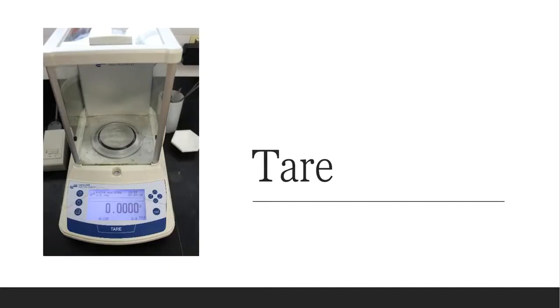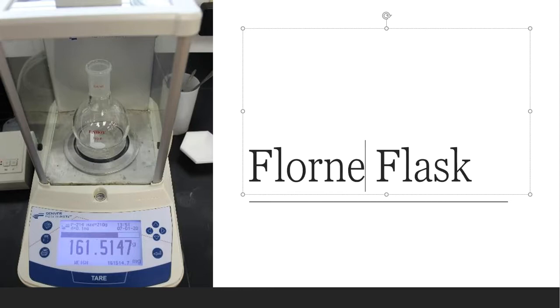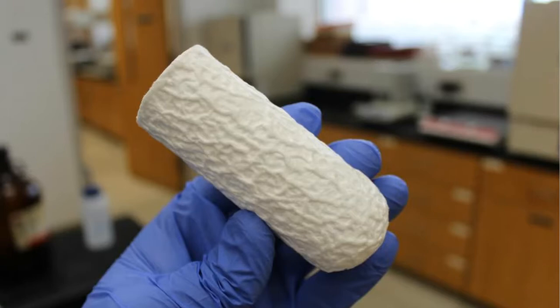All right, so I'm going to go back to the balance. And guess what? I tare it. 0.0000 grams. And then I'm going to take, not a boiling flask, but a Florence flask. Look at me. I'm already making a mistake. So I'm going to take my Florence flask, and then I'm going to add it onto my balance. That also includes my magnet, by the way. Do you see that in there? My magnet is present. And this is 161.5147. So a tared balance with the Florence flask and the magnet, 161.5147.